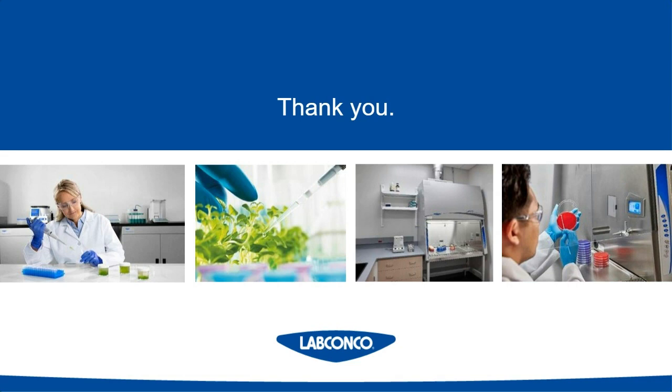What is the lifetime for an A2 hood, and how is the maintenance on that? Okay, so typically it kind of depends on the manufacturer, but at Labconco, we would say our biosafety cabinets have about a 15 to 20 year lifetime. And that being said, we have biosafety cabinets out there that people call about that are over 20 years old. So sometimes it's not about how long the cabinet is going to last, but how the safety rules and regulations change over that time.